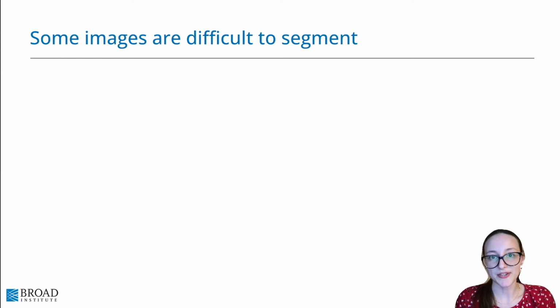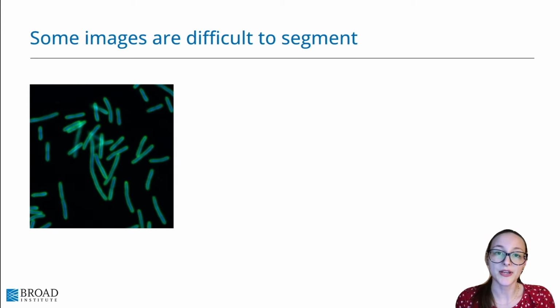Here are a couple of images from the tutorials that we'll be showing you today from the data sets. I'm going to show each and talk a little bit about why they are challenging.